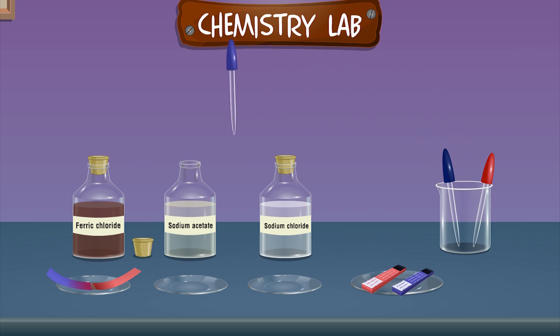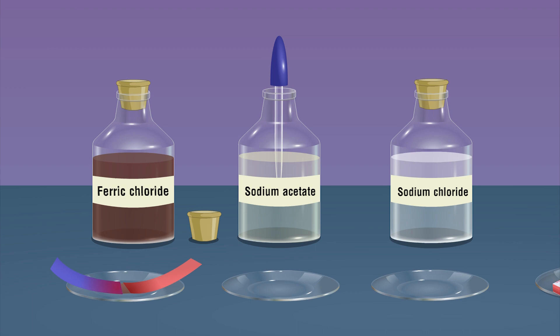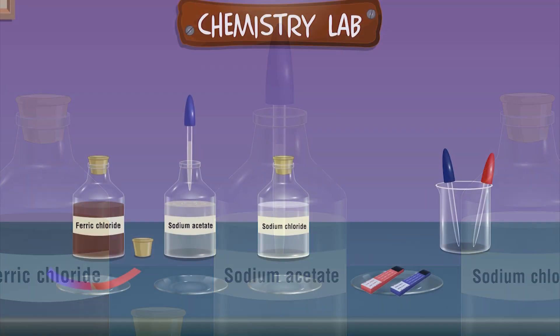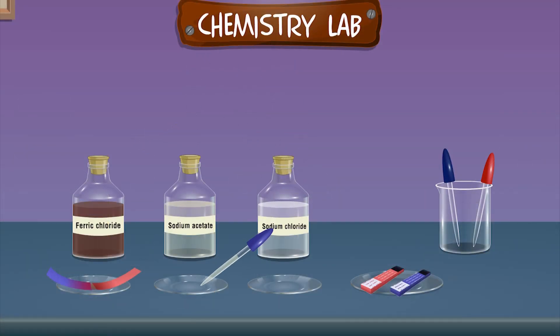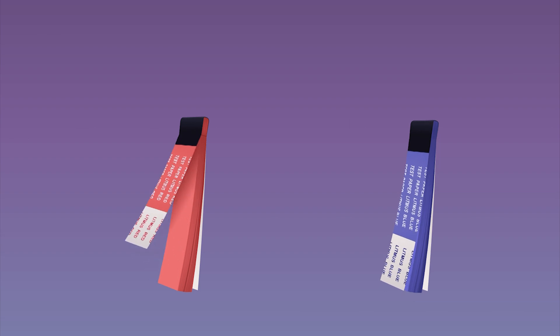Take about 1 ml of sodium acetate solution in a watch glass. Take a piece of blue and red litmus paper and dip it in the solution.